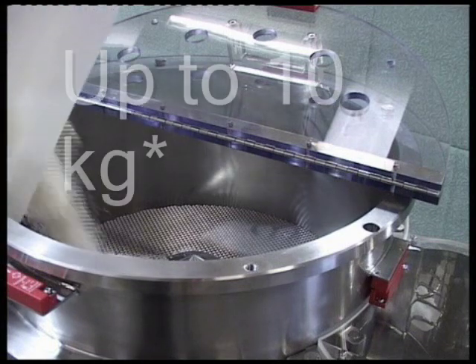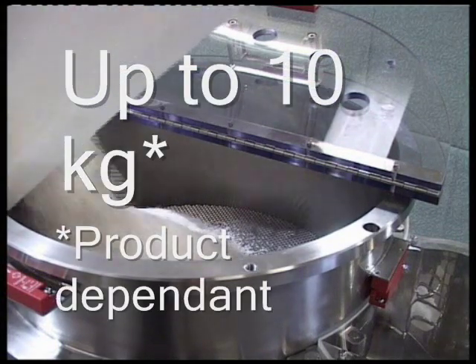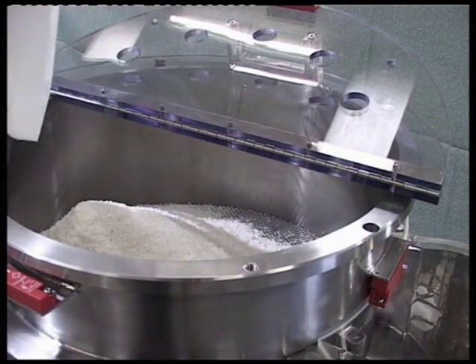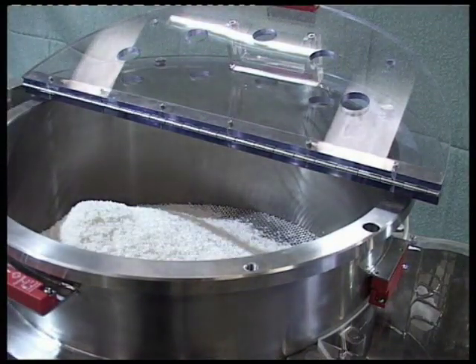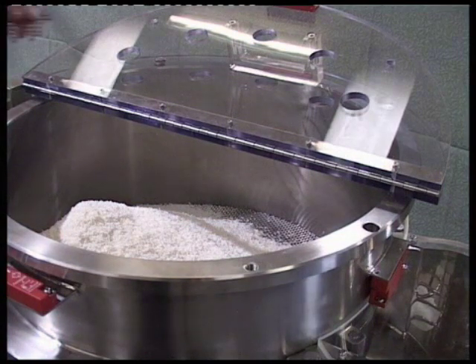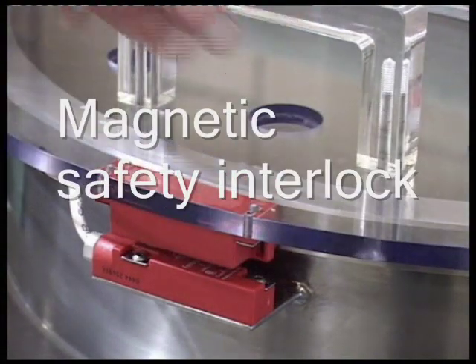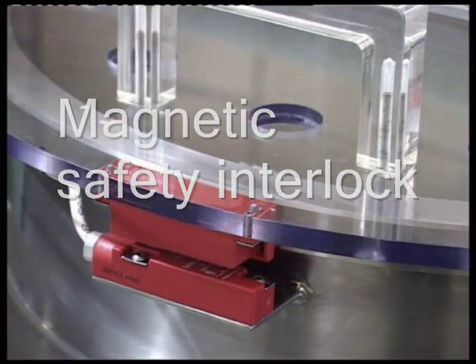Batch sizes of uncut extrudate range from around 2 to 10 kilograms. The operator is protected from all moving parts by a magnetic safety switch circuit.